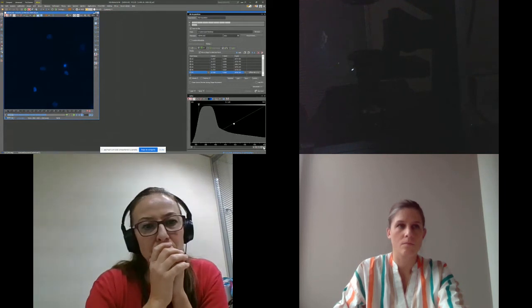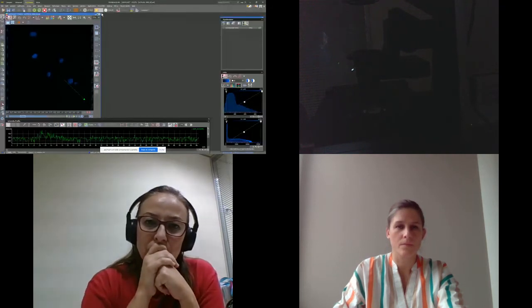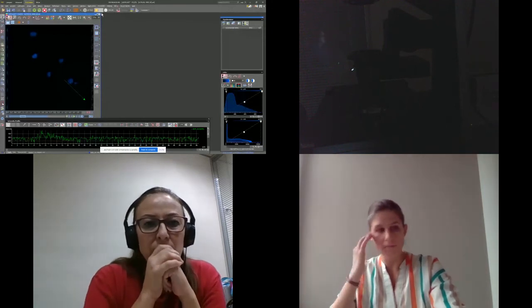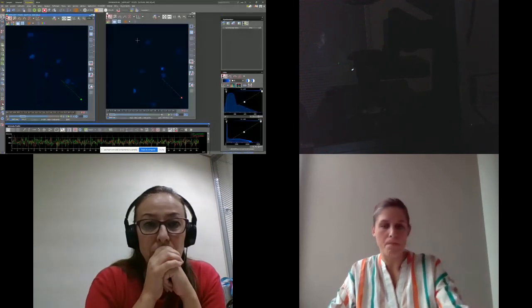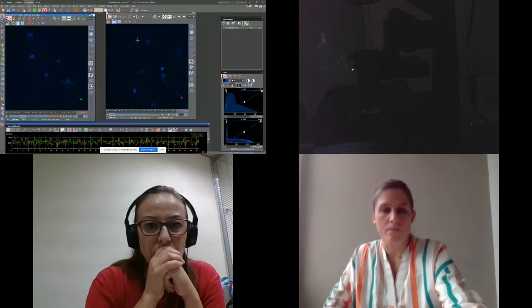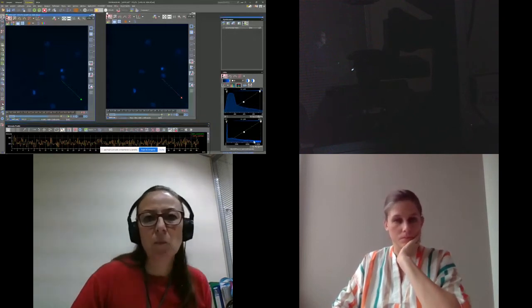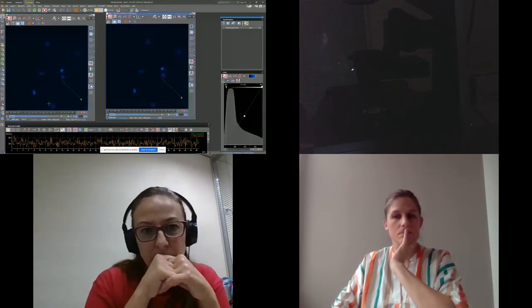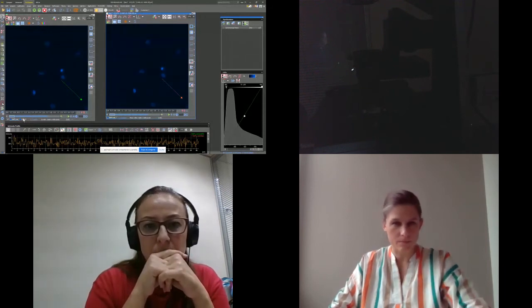We can see that in full screen. I'm going to decrease that image a little bit so that I can move the DAPI image here, and we can compare the two. So here we have the two. As you can see here, for example, in my first image, my dynamic range is really low, only 100 gray levels, and it has been expanded quite a lot in the artificial intelligence image. So I hope that you can see here, this is the reality of my image. This is my DAPI, and this is my DAPI AI.